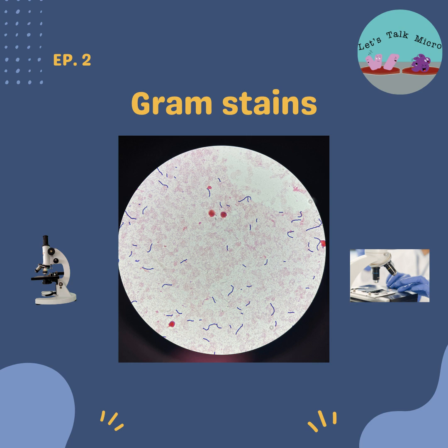So now we move on to our gram stain procedure. Your slide is already made. Very simple when you're doing your indirect smear. You get some saline and add a drop of saline on your slide. And then with a loop, you grab some of your colonies and mix them with the saline and let it dry. When you're dealing with indirect smears, you don't need much. Just a little bit of that colony is enough to give you a nice gram stain. If you make it thick, it might affect the way that you decolorize it.